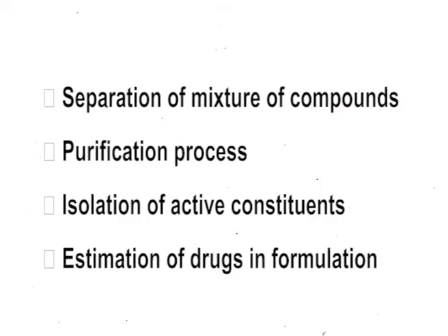Applications of column chromatography. Column chromatography has a wide range of applications. A few of them are separation of mixture of compounds, purification process, isolation of active constituents, and estimation of drugs in formulation.